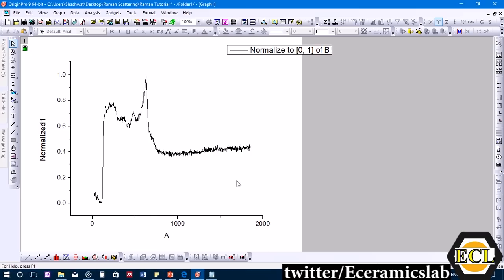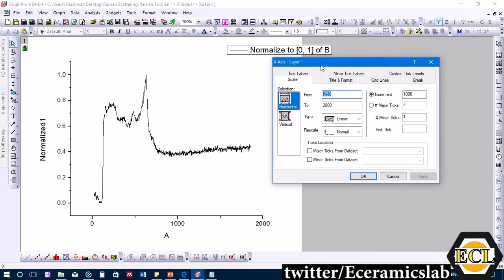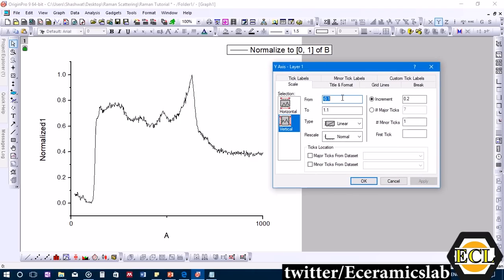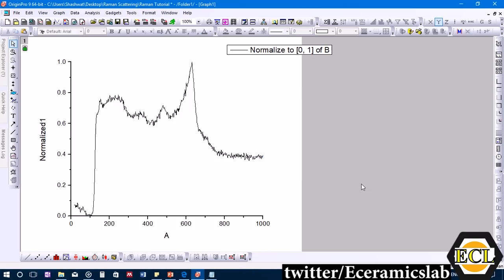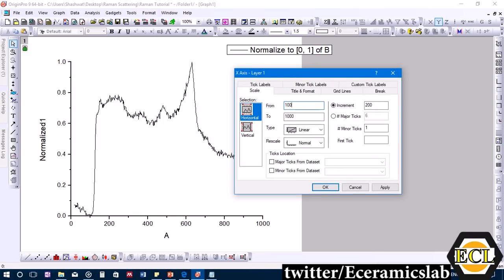Here we get a graph of the Raman scattering data. We'll set the horizontal axis range from 0 to 1000, since there is no significant change in the Y-axis beyond 1000. Since the data is normalized, the vertical axis goes between 0 and 1, with the horizontal axis having an increment of 200 to see peak positions.